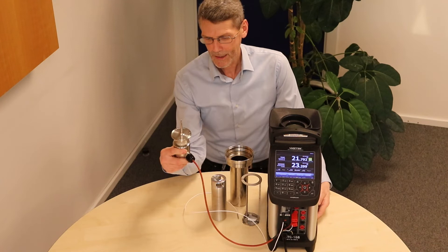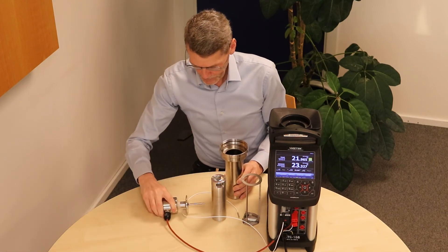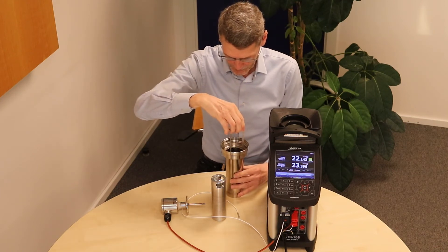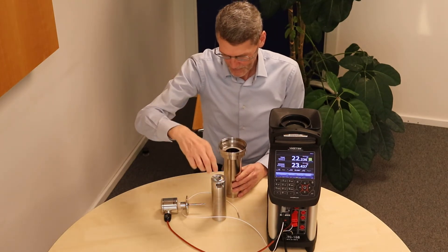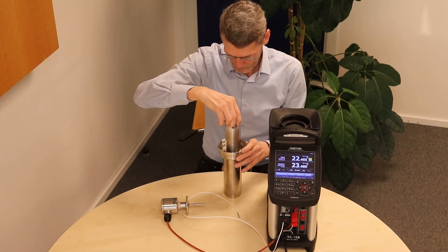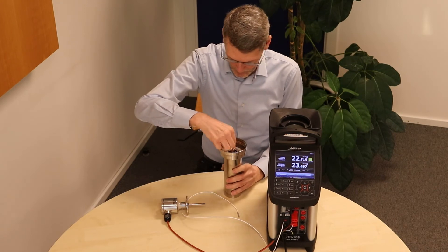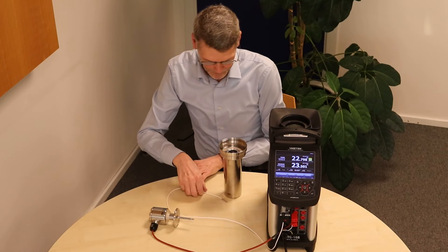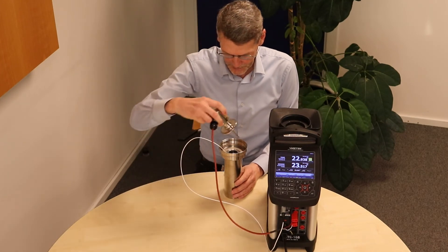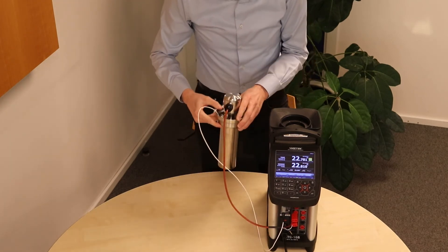Method number four: calibration of a sanitary sensor in a bath in a container. For that we need the container, the sensor basket with the steering magnet, and our patent pending heat conveyor. Then we mount the reference sensor. Now we only need the sensor under test — put it in here. Then we are ready.